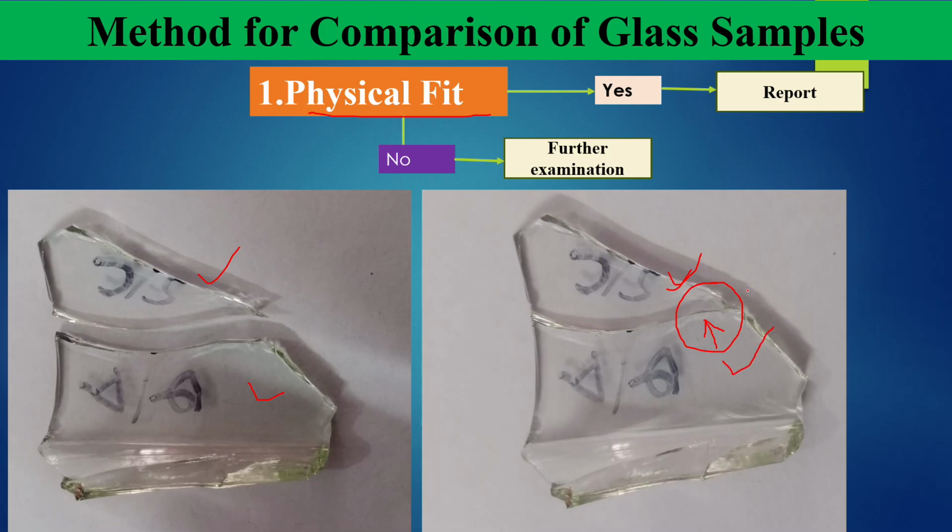In practice, in many cases you are not able to find glass pieces that physically fit.